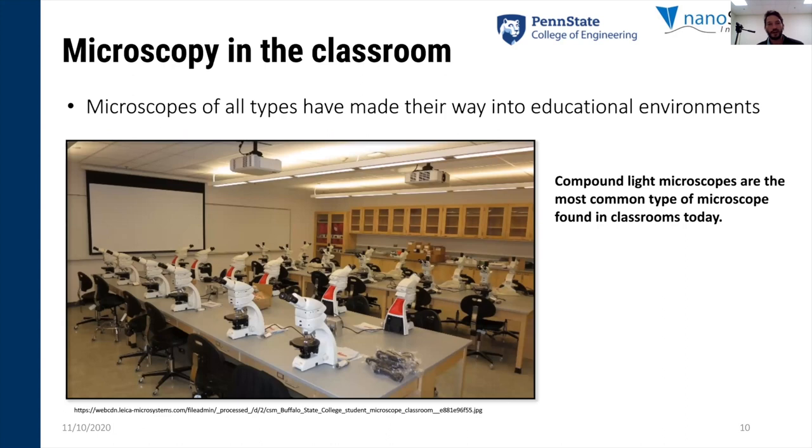So microscopes of all types have made their way into educational environments. This is nothing new, right? So here you can just see compound light microscopes on every desk in a science lab. And these microscopes are the most common microscopes used today, and there's a lot of reasons why. They're simple, they're low cost, they're readily available, and they're small, right? You can fit one on every desk.